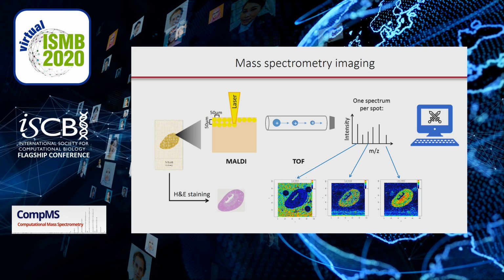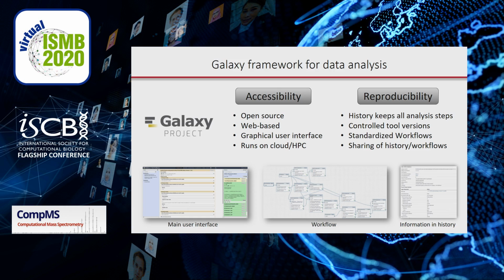To overcome these problems with MSI data analysis, we would like to introduce the MSI community to the Galaxy framework. Galaxy is an open-source data analysis platform that is easily accessible via a web browser and a graphical user interface that allows the analysis of pre-installed tools on large computational resources via public clouds.